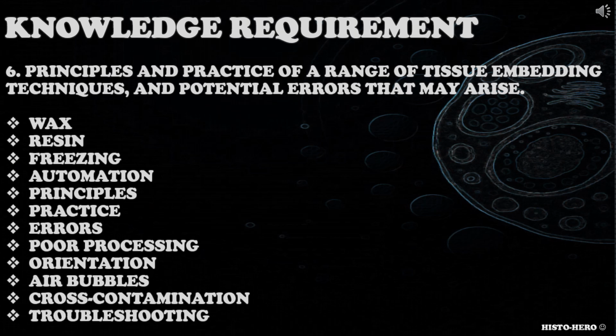When addressing this knowledge requirement, candidates should consider use of wax or resin, freezing, manual and automated embedding, their principles and practice, effects of processing on embedding, tissue orientation, potential errors like air bubbles, overheating, cooling, cross-contamination or tissue loss.